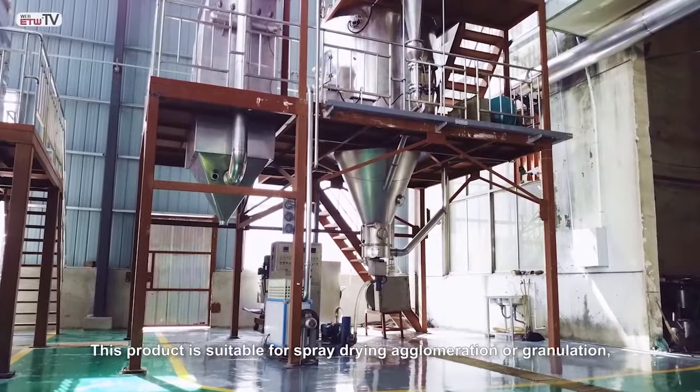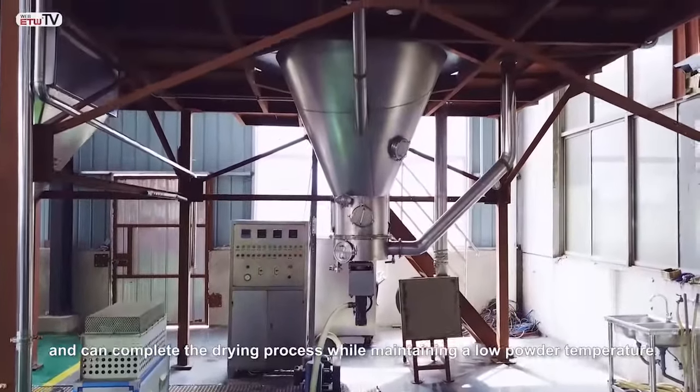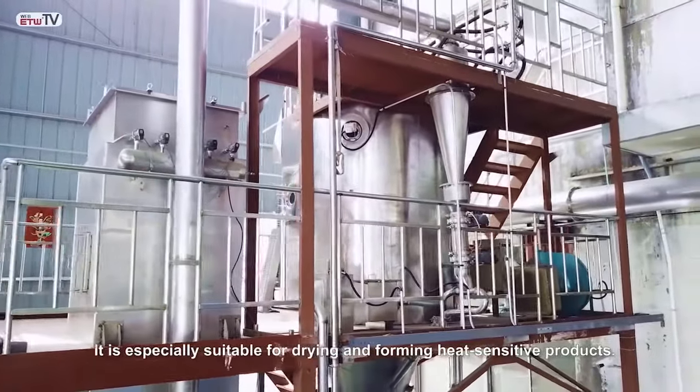This product is suitable for spray drying, agglomeration or granulation, and completes the drying process while maintaining a low powder temperature. It is especially suitable for drying and forming heat sensitive products.